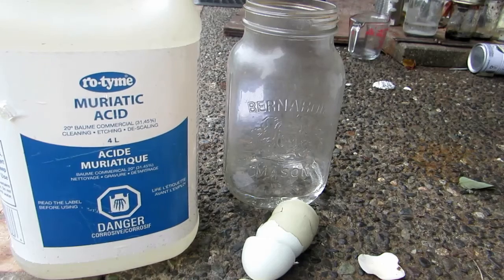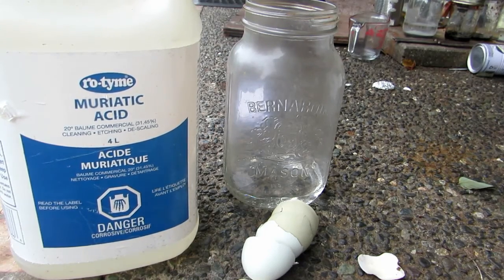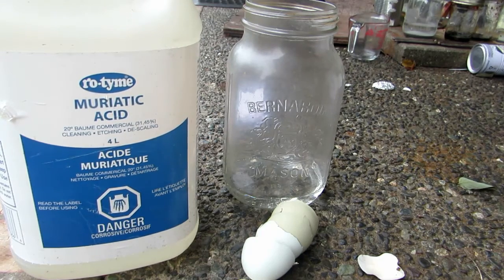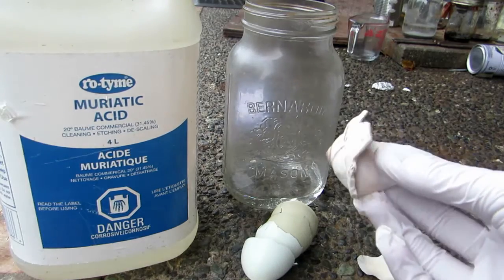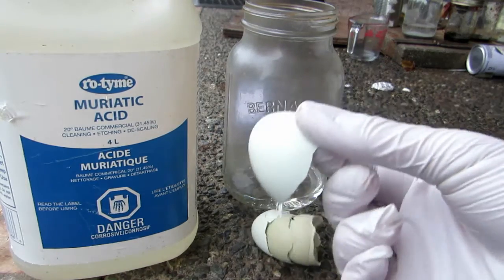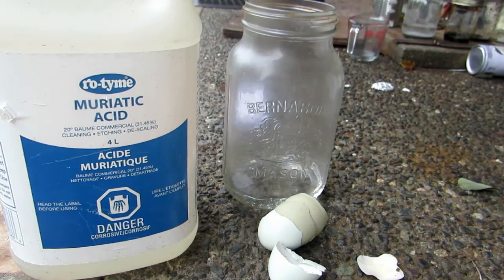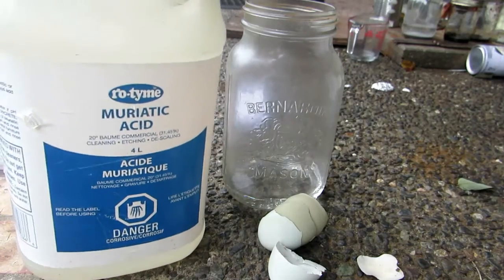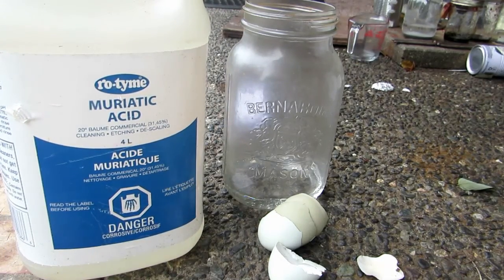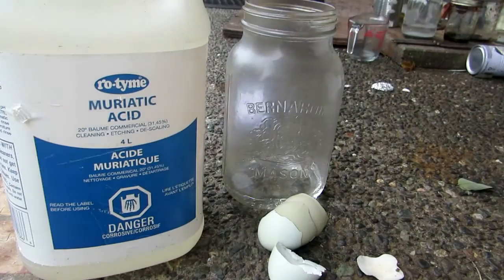Hey guys, welcome back to another video. Today we are going to be making something called calcium hydroxide, which can be fairly easily made from calcium carbonate, hydrochloric acid, and sodium hydroxide. First we must make calcium chloride, which can be prepared by reacting some sort of calcium carbonate source such as seashells, eggshells, or chalk with hydrochloric acid. This is approximately 32%, which is 10 molar hydrochloric acid picked up from Home Depot — four liters, but we'll only need about 100 milliliters for this, unless you want to scale it up.